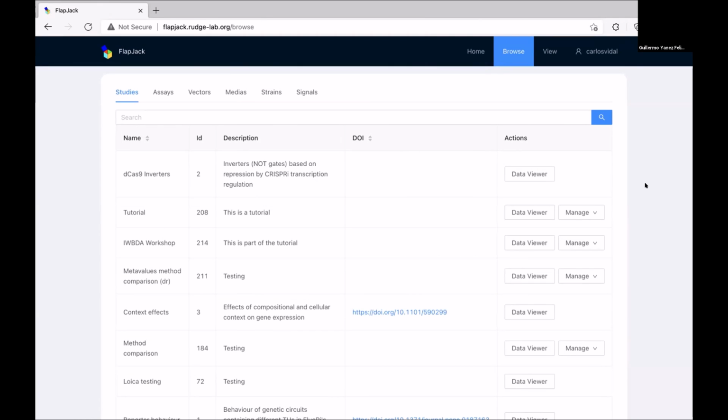So you are able to connect a machine permanently, so that when you run an experiment, maybe overnight, it sends the plate read directly, and a script can run it through the presets you set up to have analysis for you in the morning. This is more like our aim, our dream. For example, we are working now with an OpenTrons liquid handler. So we would like to run some code from Flapjack to be able to modify some of the settings of the OpenTrons, or to control the time that experiments start running, etc.